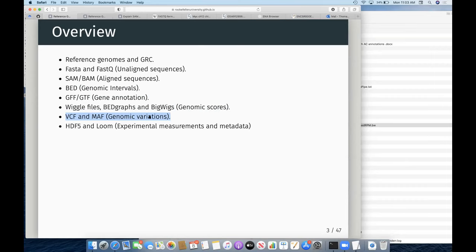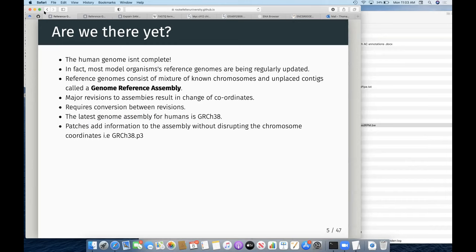Finally, fitting with what Connie was talking about with single cell, I'm going to talk about how we handle some of that data too. So first off, reference genomes — let me make this a little bit bigger.